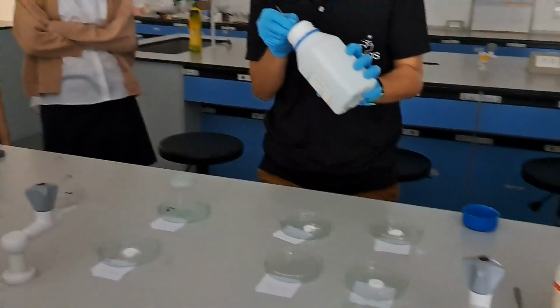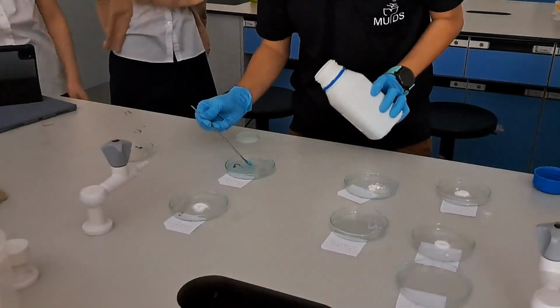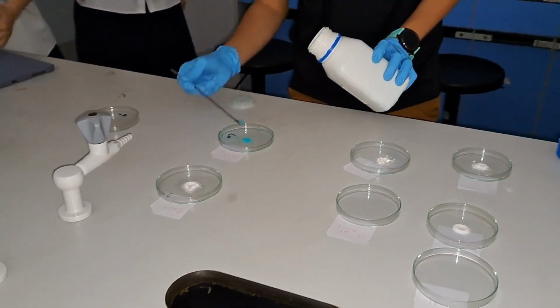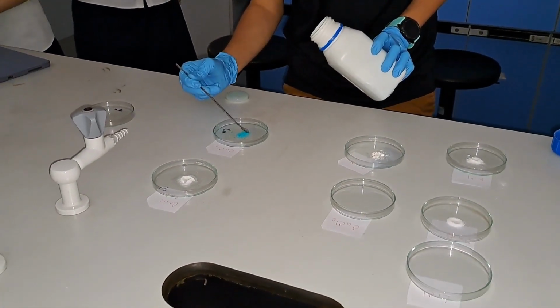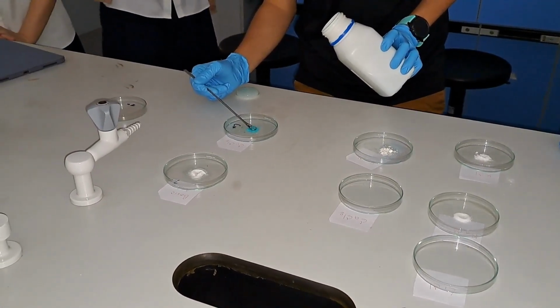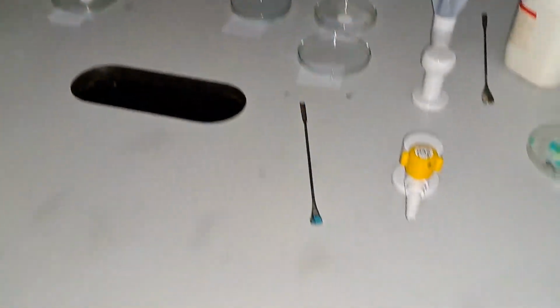This is called a flame test. Turn on the light. So we have many compounds. Most of them are compounds with chlorine ion. Alright, so that is copper.